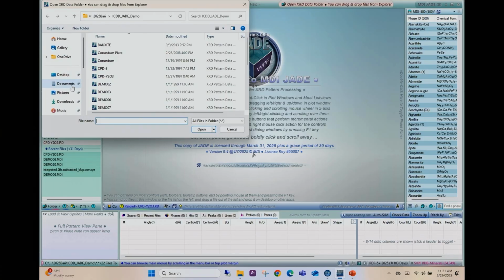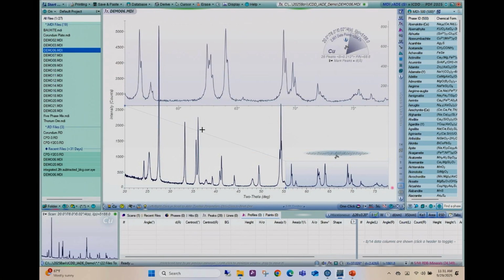And when you click on Documents, there are going to be folders there that have the data you want to look at. And again, I'll be here a couple days. If you want to see me, I'll help you get started. Okay, all right.